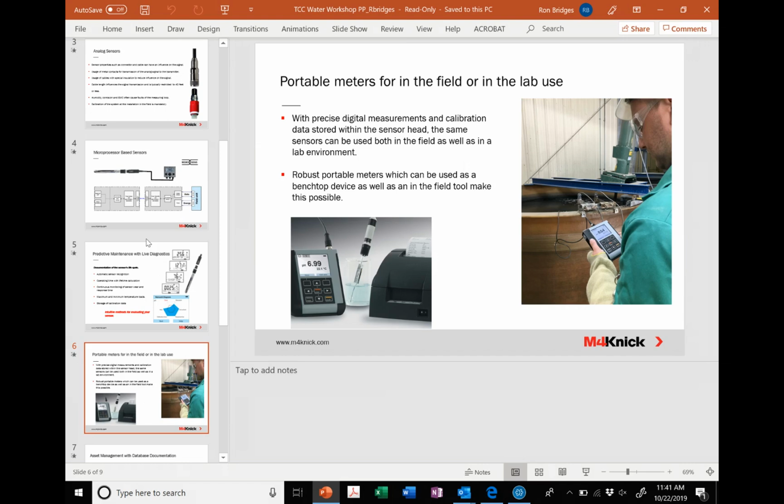I do my calibration with a portable calibrator. I disconnect the electrode from that portable calibrator, and now instead of taking all of my buffers and cleaning solutions, all I need to do is carry that pre-calibrated electrode out to the field, disconnect the sensor that requires maintenance, connect the new sensor, and it automatically uploads the calibration into the transmitter.